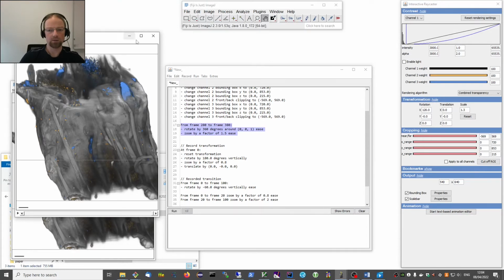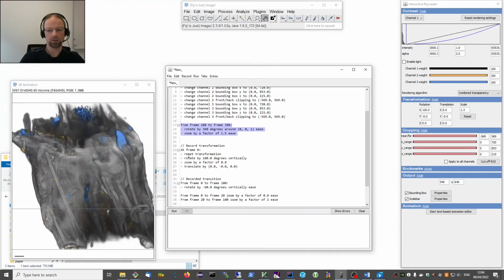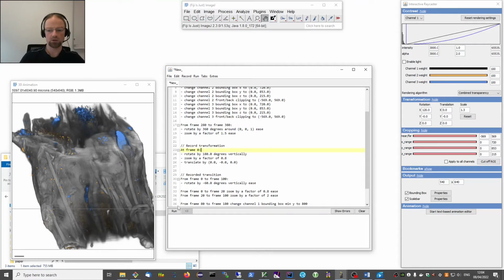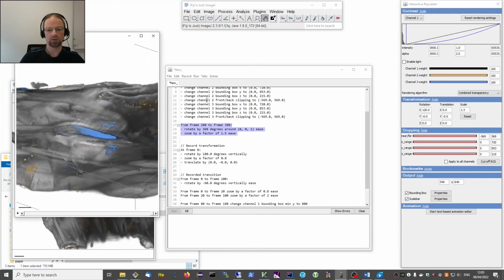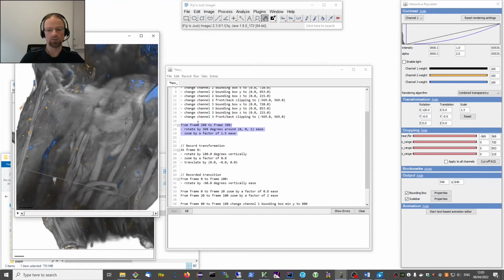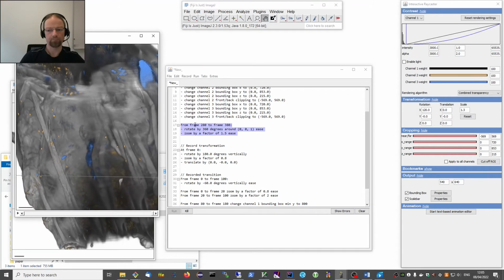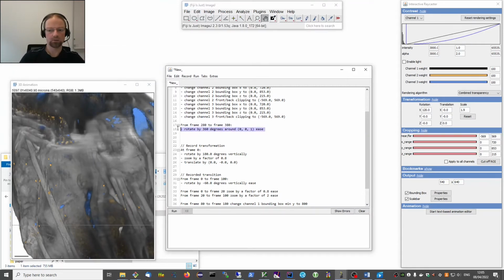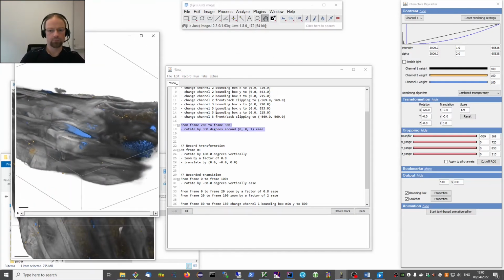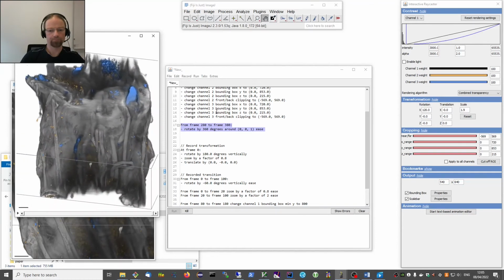Okay, I think I missed something. So indeed, I can spot it. So we need to get rid of this reset transformation again, which I mentioned earlier. And so again, let's do this once more from 2. Okay, and this is indeed what we wanted to see. So I think I would get rid of this zooming here. This is too much. Let's quickly check. Yeah, so that's better.